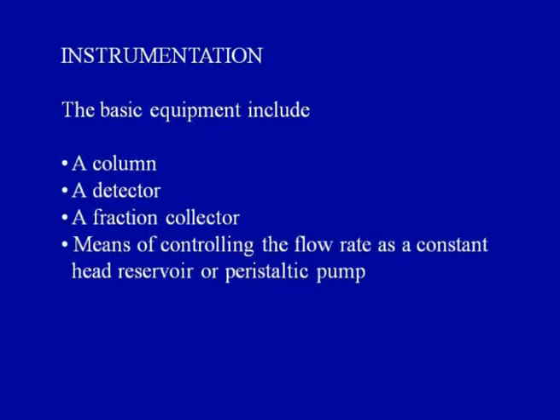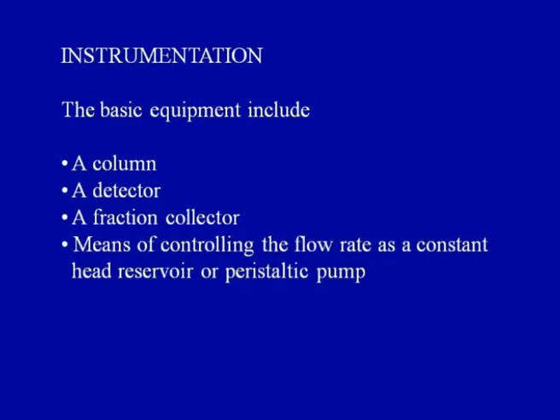Now, if you consider the instrumentation of gel filtration, it is very basic, as we have already discussed earlier for low pressure chromatography and for high performance liquid chromatography. The basic part is you require a column, which, like I said, is a long, narrow bore column.